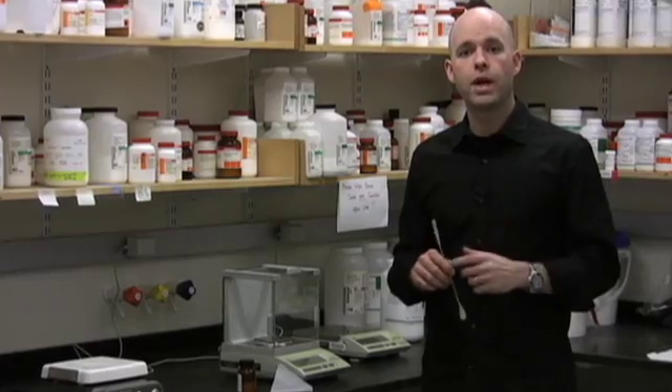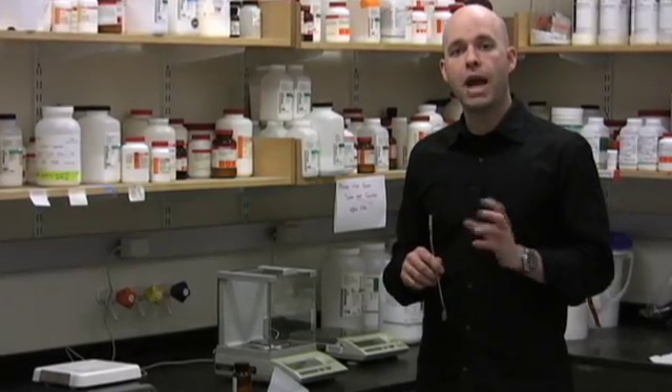Oftentimes you'll find yourself weighing out a small amount of material — one or two milligrams — and in these cases there's a very particular way to weigh out that makes it a much more accurate measurement.